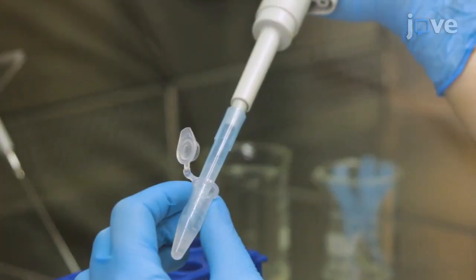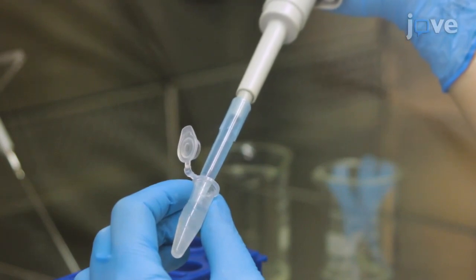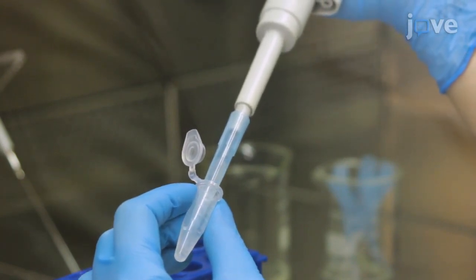For mechanical tissue dissociation, gently pipet the tissue trypsin mixture up and down 15 times.